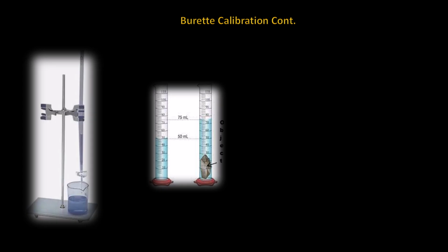The density, either written as lowercase p or d, is the mass of the calibration weight divided by the amount of liquid displaced, and recorded as grams per cubic centimeter. Since 1 milliliter is equal to 1 cubic centimeter, as shown, the hypothetical volume of the object is 25 cubic centimeters. If the weight was 50 grams, then 50 grams divided by the volume of 25 cubic centimeters, the density would be 2 grams per cubic centimeter. The weight of the calibration scale and its density must be recorded.